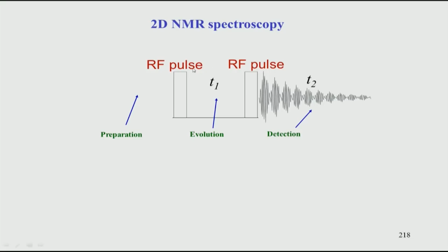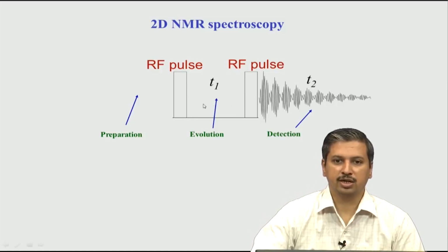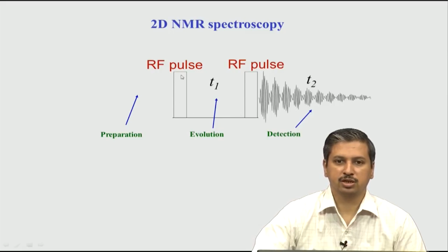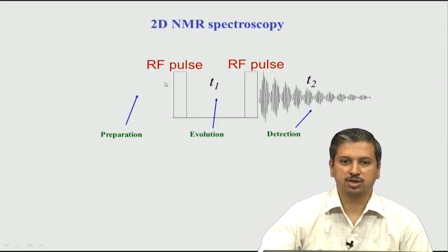So, we saw this is a very simple schematic scheme which has basically an RF pulse applied and then you evolve, and during this period we said we can transfer the polarization or magnetization to B and then it gets detected. Again remember, this is non-selective in nature, meaning this is not just applied to one spin in particular, it is applied to all the spins in the molecule.